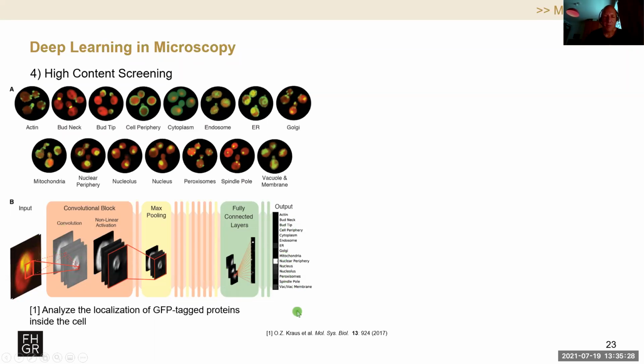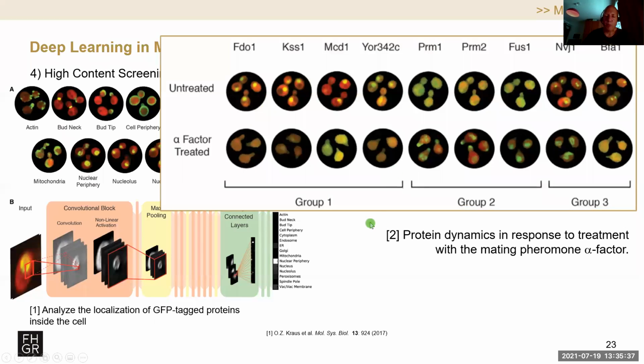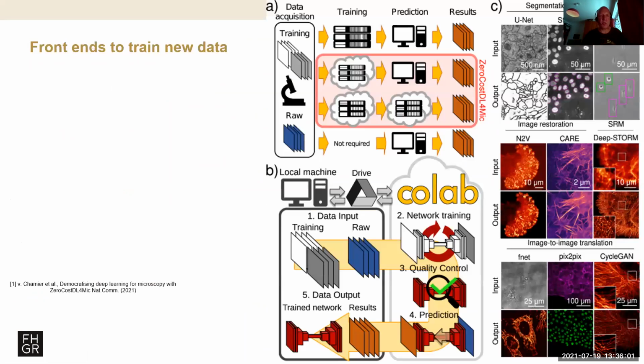And then it's up to you what you do with that prediction. Hopefully we will find some sort of meaningful outcome from such data, being able to analyze all the cells that are being presented and discriminate by various factors, potentially finding diseases, finding new drugs that are successful and can be used to treat diseases.